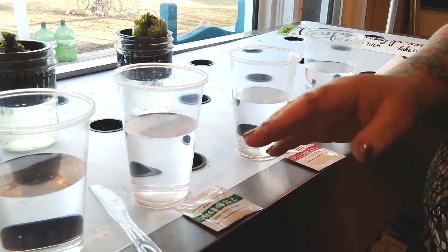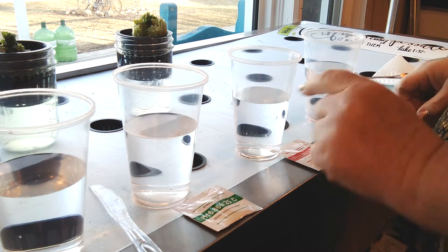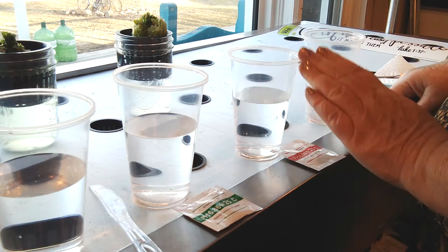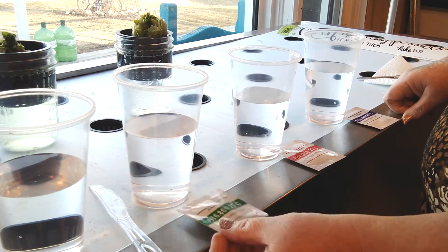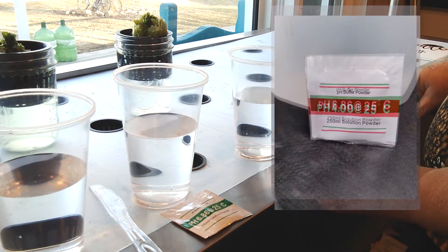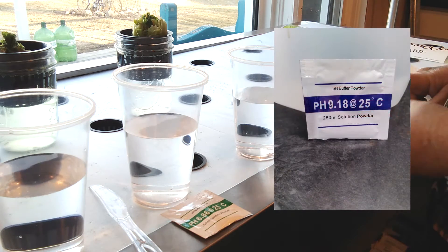When you receive your pH monitor, you're going to receive some solution to help you calibrate the pen — it needs to be calibrated. You're going to receive three different solutions: a pH 6.86, a pH 4.0, and a pH 9.18.